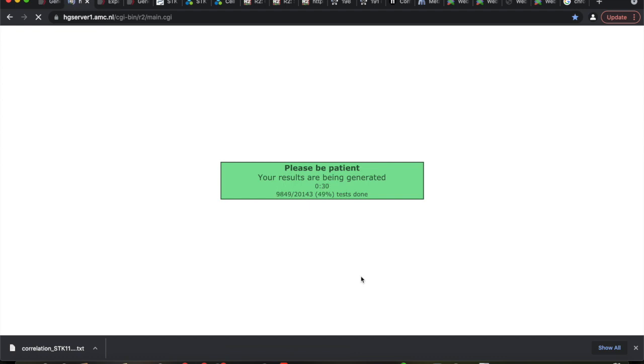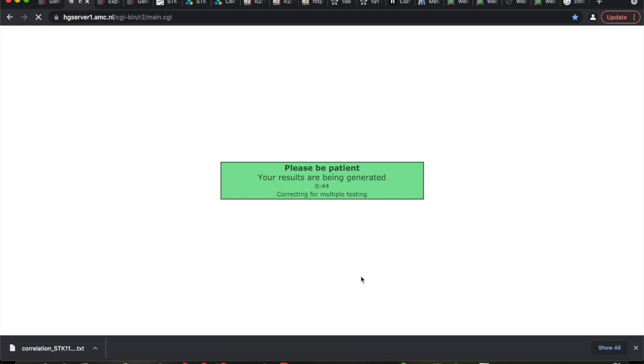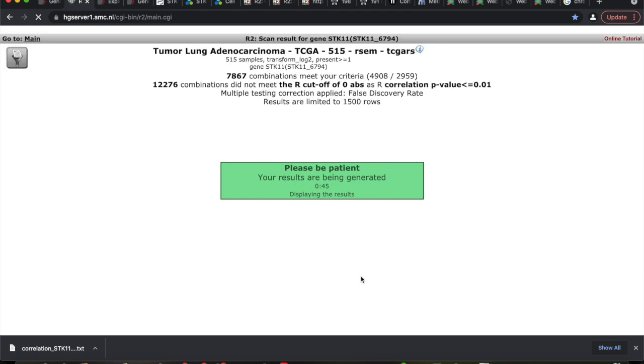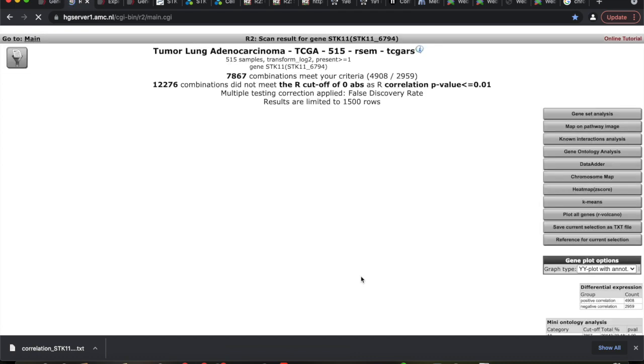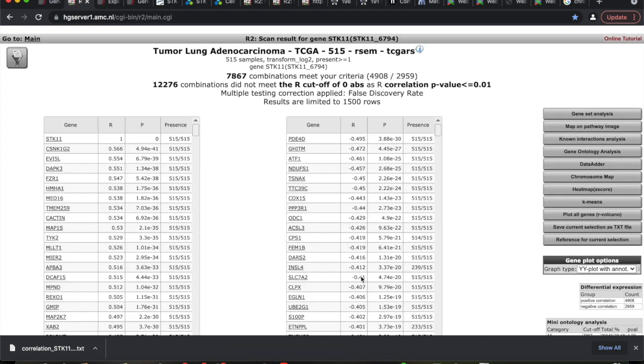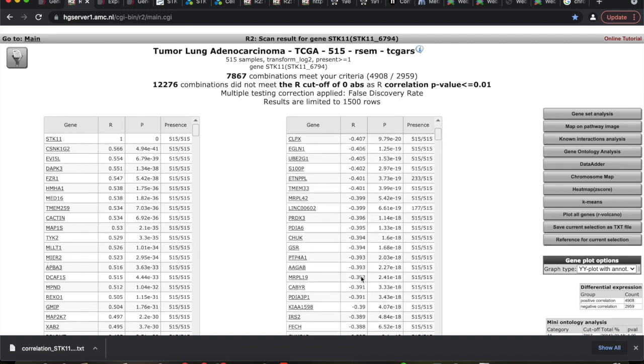You could do this several times. I could do that for STK11 in this database, and then I could go back and do the same thing in that other database. Then what I could do is actually compare the results and only take what's common. I've done that before. It's like the best gene list you've ever seen. It's so awesome. Did everybody get this? Did it come out?